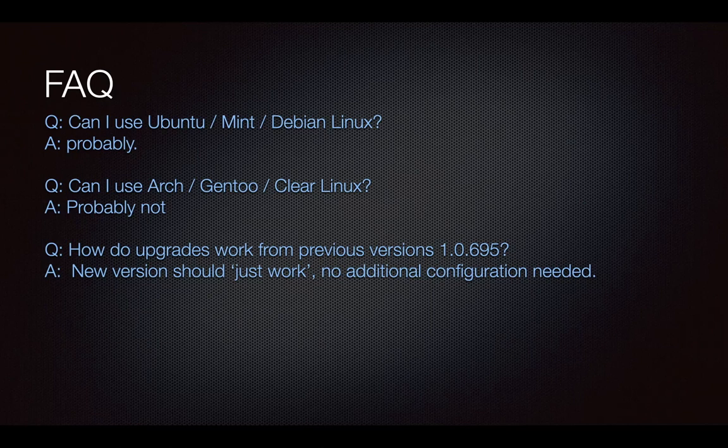It's built on kind of an aging stack, and at some point it will just stop working on new Apple operating systems. The command line version is always going to be more compatible with everything, but the new version should work on Big Sur and newer, but the old one you'll eventually have to migrate off.